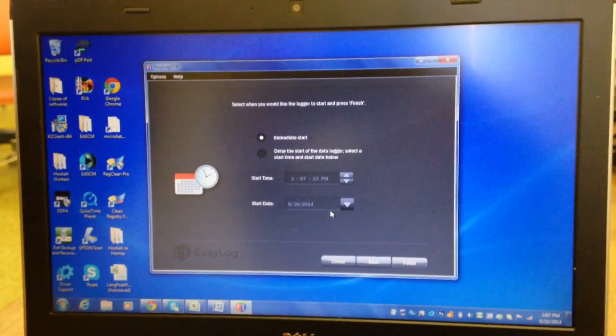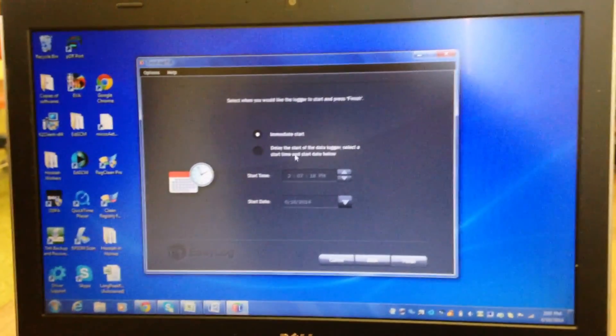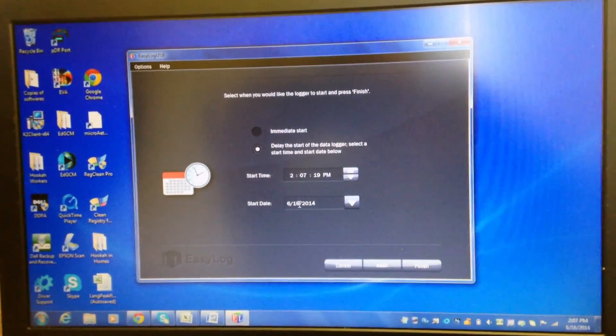In order to turn the monitor off, insert it back into the USB port and select the stop monitor icon. Your data will then be uploaded and can be exported onto Excel.